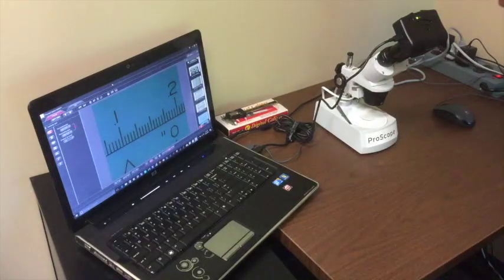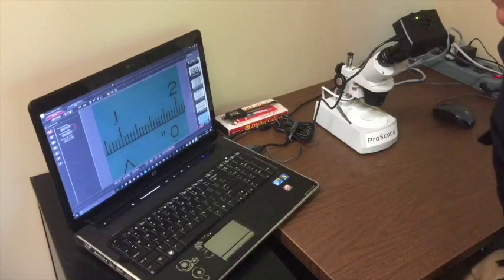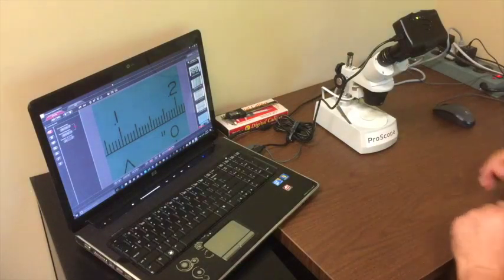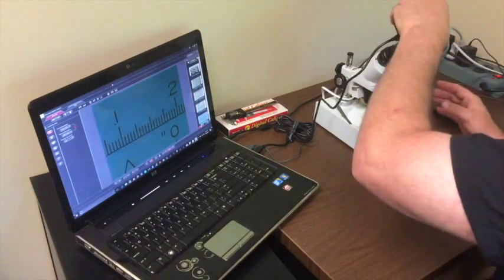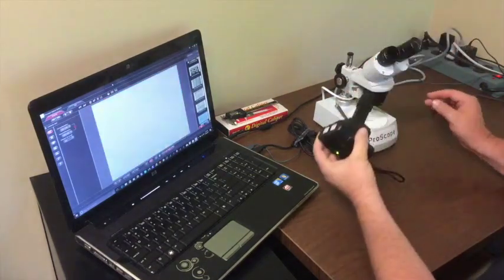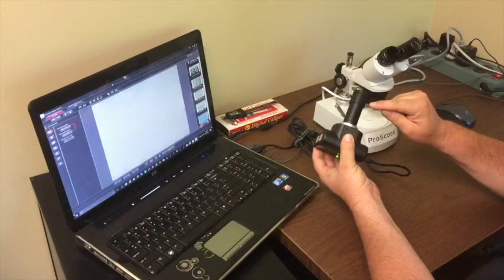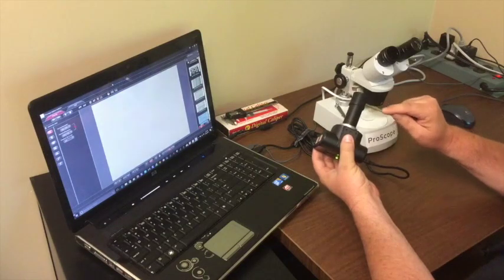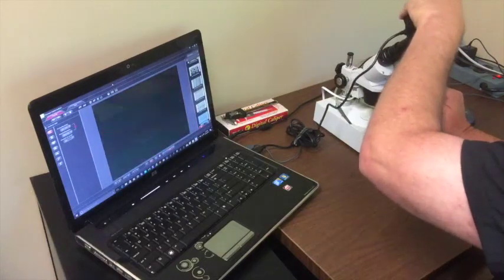This is a setup and operation video using the ProScope microscope camera and a traditional inspection microscope. Here is the traditional inspection microscope. One of the eyepieces has been removed and replaced with the adapter for the ProScope microscope camera, and then the microscope camera is slid into that eyepiece.